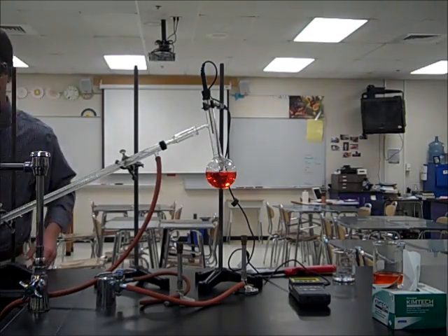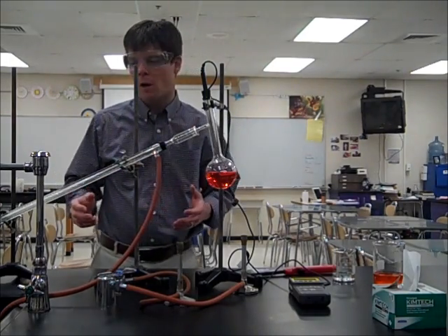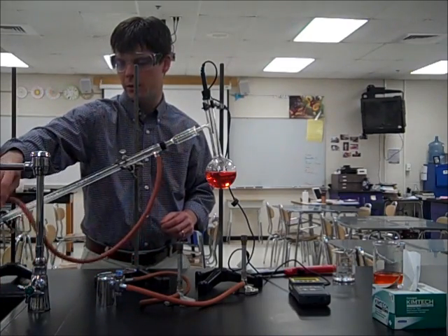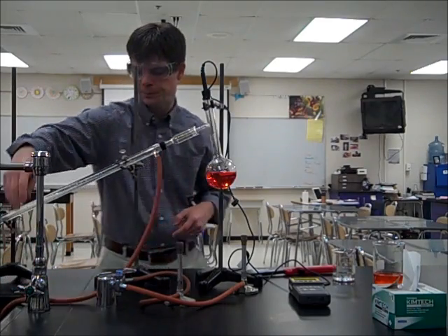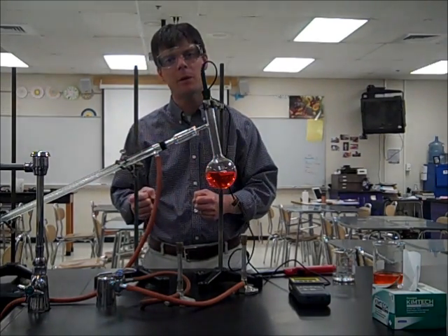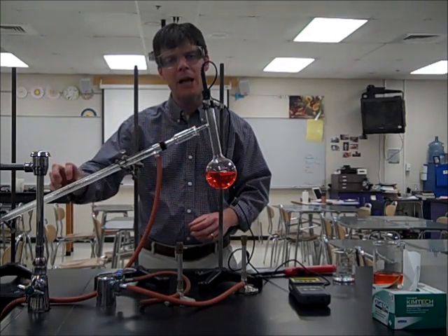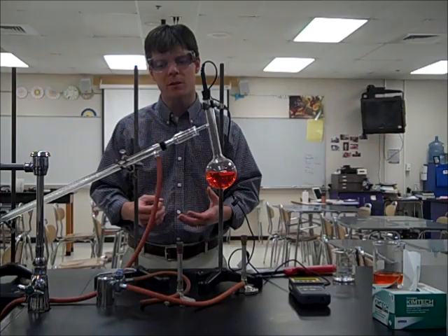I'm going to go ahead and turn that on right now. The water is entering through the bottom inlet right down here and there's water flowing out through this tubing back into the sink. The purpose of the cold water flowing through the condenser tube — which is actually two tubes, an inner tube and an outer tube — the outer tube has the water flowing through it. The purpose of the water flowing through that outer tube is to keep the glass on the inside of the condenser tube cold, and this is going to help to condense the vapors that are formed during the distillation process.